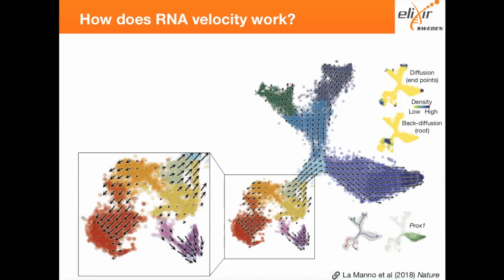Yeah, the reason why it works in inference is that it's thought that there is internal priming. So if there are a lot of A's in the intron, the oligo-dT primer binds to them. So there's a sort of internal priming. That's why you get reads from somewhere in the middle of the transcript, and not only from the 3' end. Slightly, yeah, but they're long.